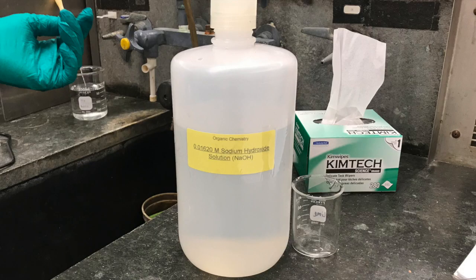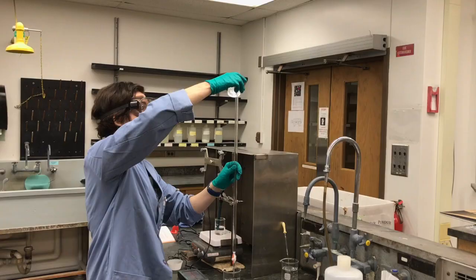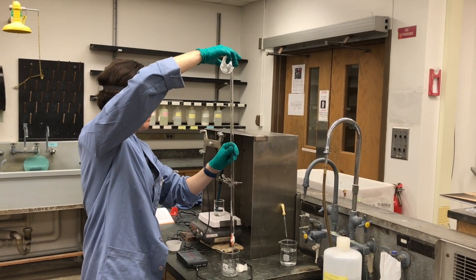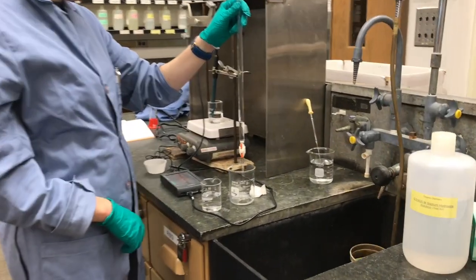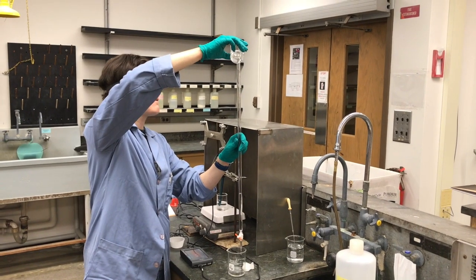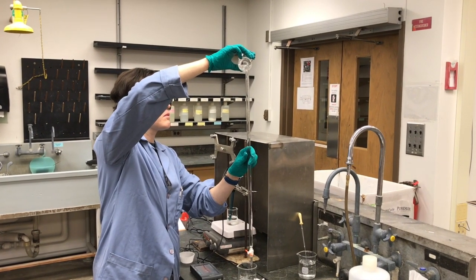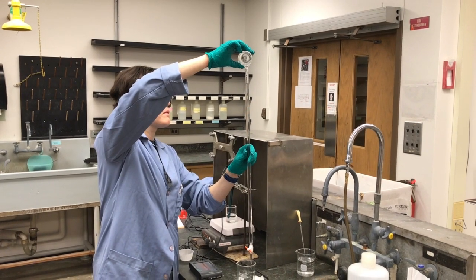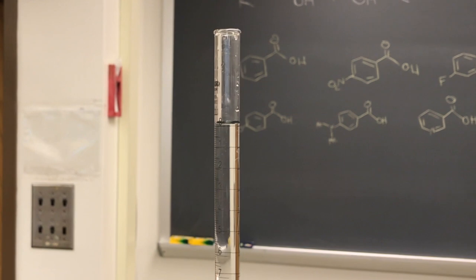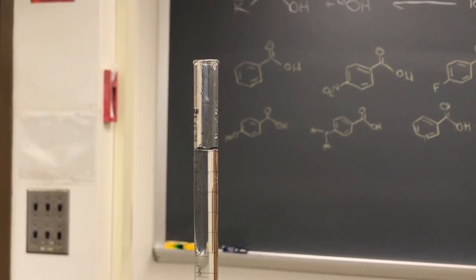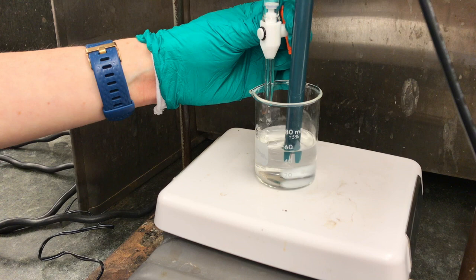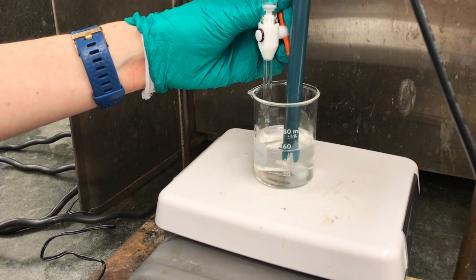Now we're going to set up the titration, but before that it's important to note the actual concentration of the sodium hydroxide solution that we'll be using. You get your burette and the first thing you do is add a little bit of the sodium hydroxide solution — just enough to wash it down. After you've drained that first solution, now you want to fill it all the way up to the top. We want to get as close to that zero mark as possible so that it'll make all our calculations simple. This is the setup: get the pH probe all the way inside the solution, then clamp the burette so that we can easily dispense the sodium hydroxide. We'll start out by adding half a mL at a time.